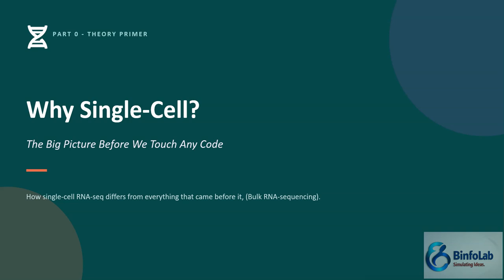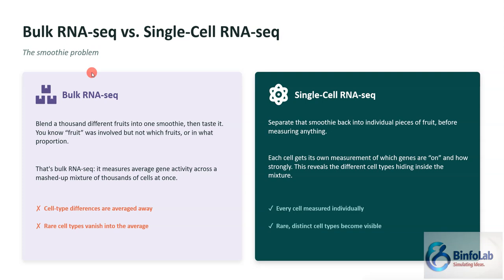So why does single cell sequencing matter? The big question is, why single cell? Because before single cell, there was another technology and we were naming it bulk RNA sequencing. So, what are the pros and cons of single cell sequencing as compared to bulk RNA sequencing? In this slide, we will briefly cover bulk RNA sequencing versus single cell RNA sequencing.